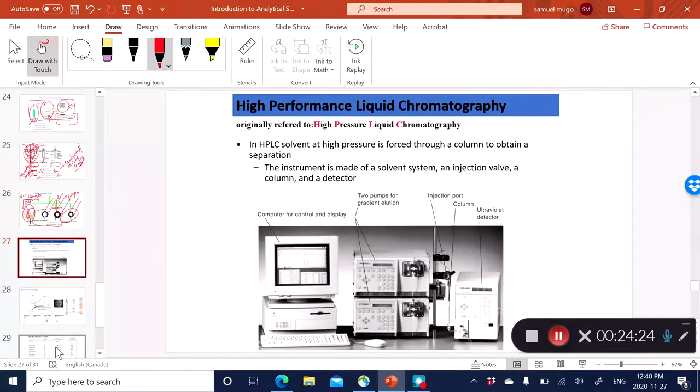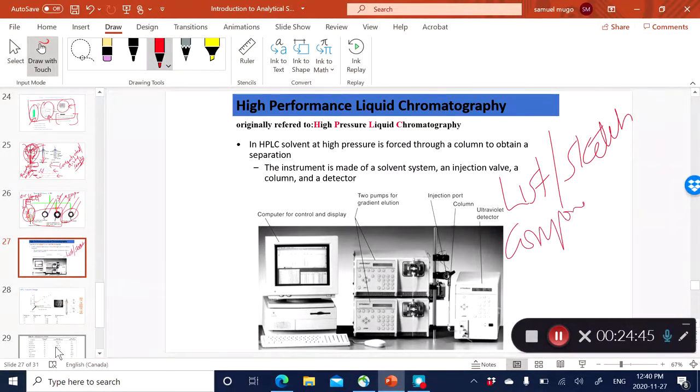That's all that I'm gonna say about GC chromatography. All right, so the other thing that I'm gonna talk about very, very briefly is high performance liquid chromatography. And all I'd like you guys to remember is to be able to list, or even sketch, the different components of LC. Of course, we all know the heart of it is a column. But in this case, you need a pump so that you can pump the solvents through the column. And then lastly, you've got a detector.